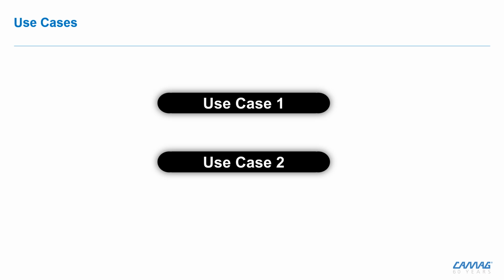Before concluding this webinar, I would like to say that the classification tool offers powerful flexibility with multiple algorithms, wavelengths, and hyperparameters, which is great for advanced users. However, the results can indeed be very sensitive to these settings. Therefore, we try to keep the commonly used values and selection as the defaults, unless the user has more experience to alter them.